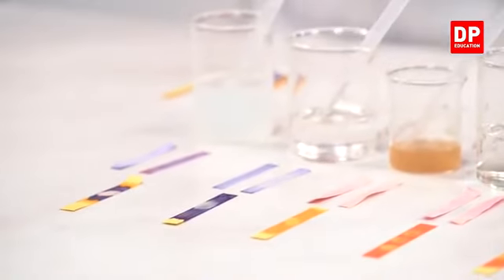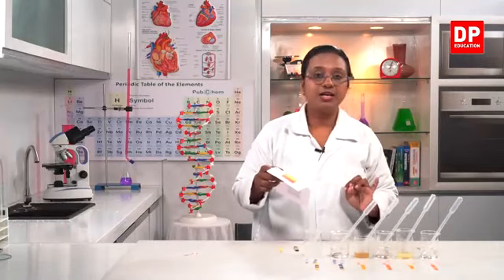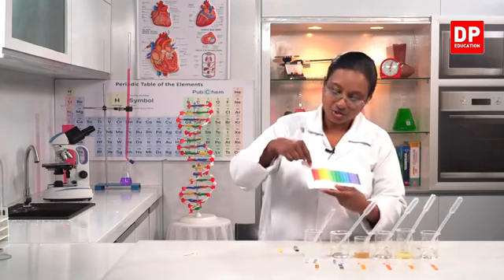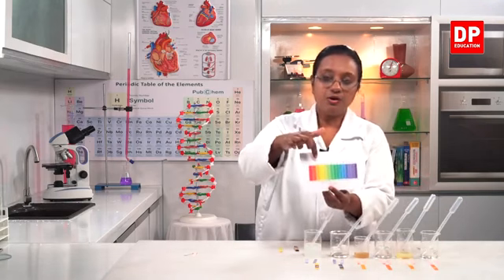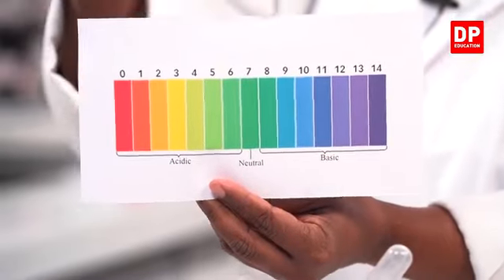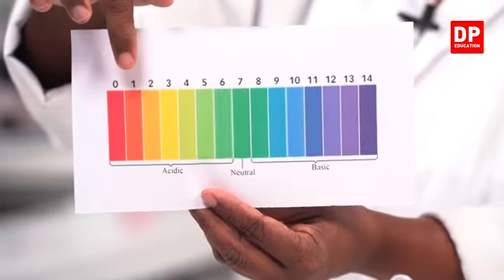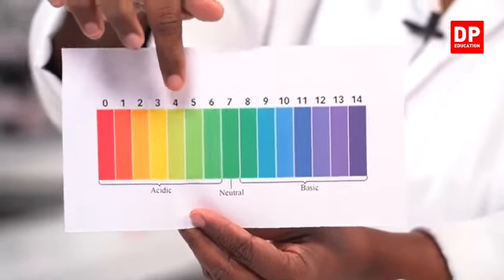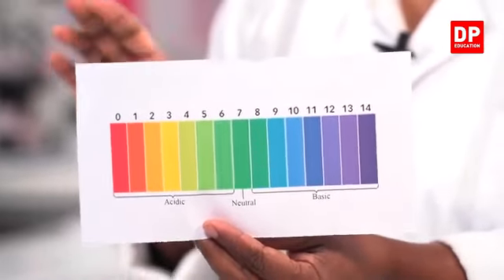So from the scale, we can read that hydrochloric acid and sulfuric acids, they are strong acids. So they show a pH either 0 or 1, sometimes 2 also, towards 2. But when you take the weak acids, they show pH values between 2, 3, even 4, 5 up to 6 is the acidic pH.